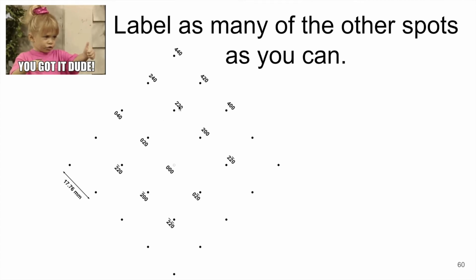Since this is 220, that means it's going in both the x and y directions. So this must be the y, because this is the x, and this is an equal distance, as it should be in cubic. So this is the 020, and then this would be the negative of that. This is the 040, et cetera. So you can label those in this line.